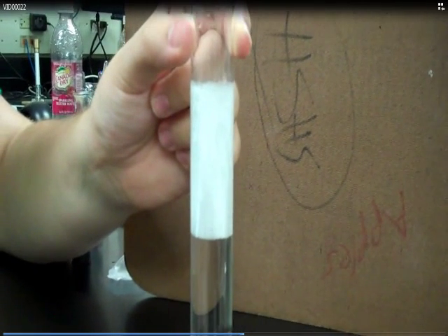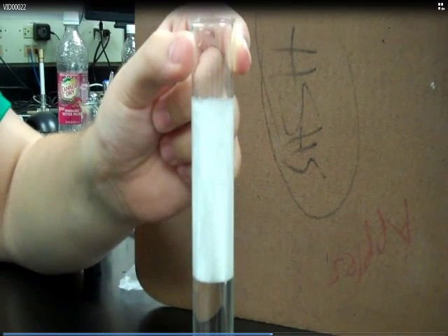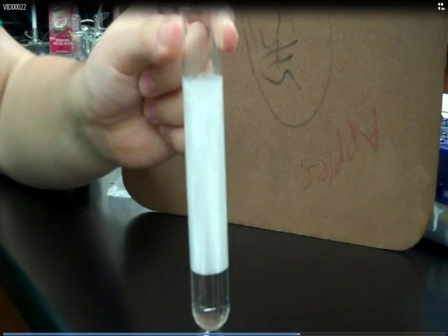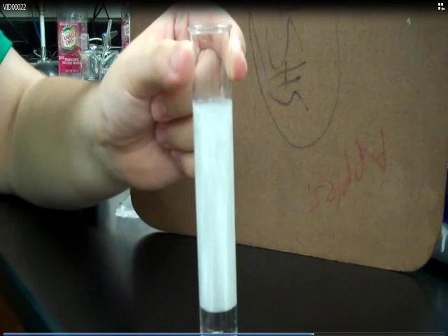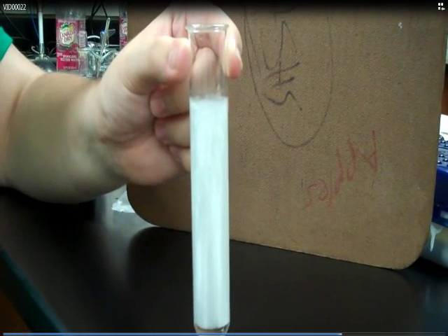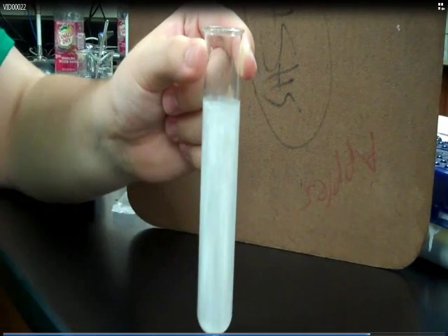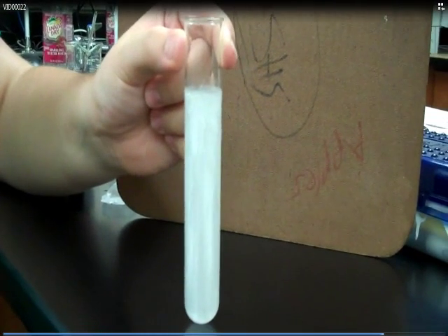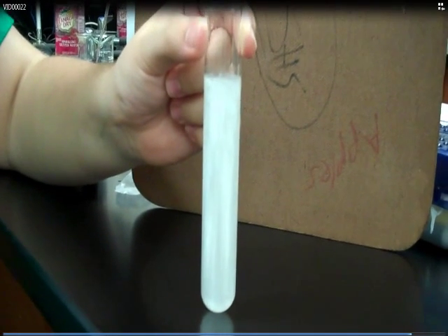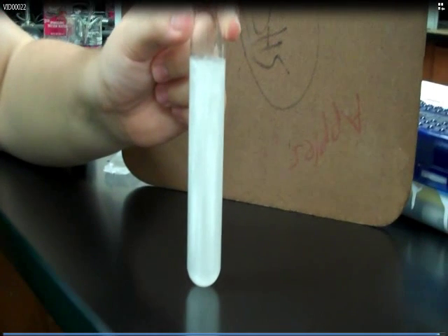The excess crystals are the solute that should not be in solution at this temperature, which made the solution supersaturated. They're now all rushing out of solution to return the solution to what we would consider a saturated state. Now, if Mason were to feel the test tube, it is hot. Energy had to go in to make the solid dissolve, so as the solid comes out of solution, energy is released back out, making the test tube hot.